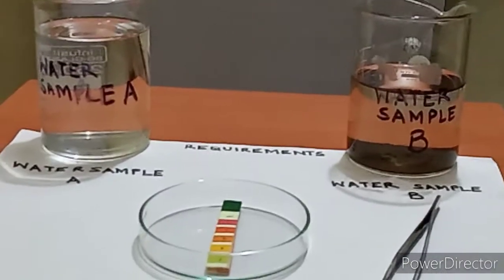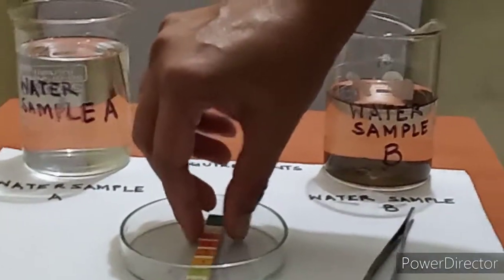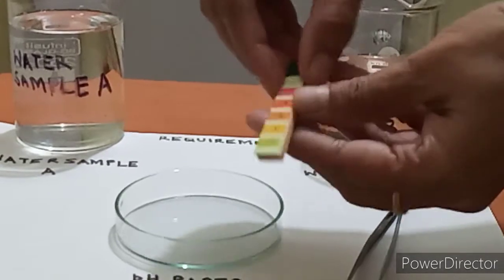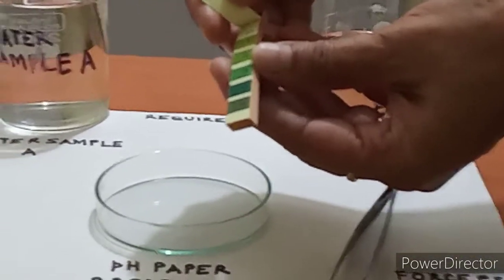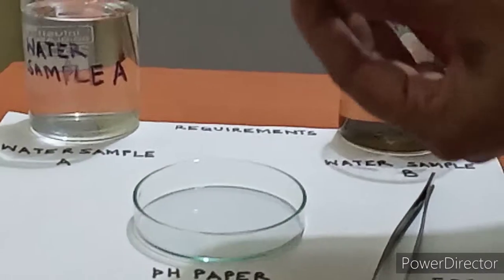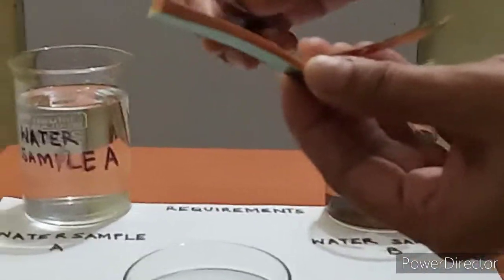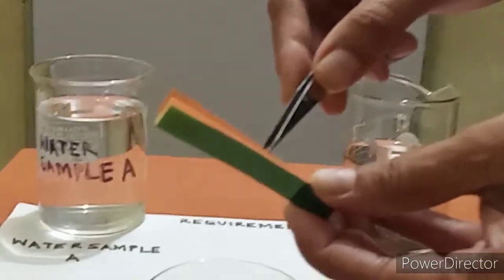Now for this experiment, first of all, we are going to take the broad range pH paper. This is the broad range pH paper. Here you can see the color and the pH which is written against it. Now pH paper is very sensitive, children, so we have to use forceps for taking the particular slip of this pH paper.